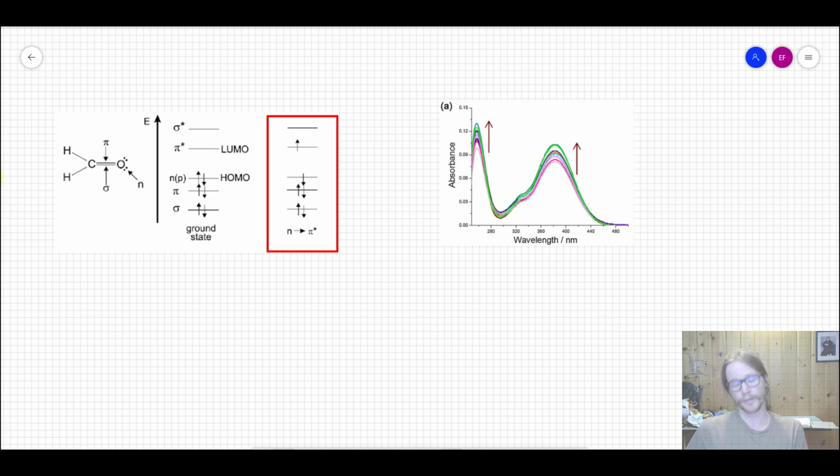So we've spent a considerable amount of time now talking about the format and the setup of how to conduct a spectrophotometric experiment, specifically in the UV and vis ranges, or I guess more time is spent talking about those things. But I want to connect that back to the molecular level so that we can have that intuition of what's actually happening. And I alluded to this along the way, but I want to be a little bit more clear here. So what I have is a molecule.